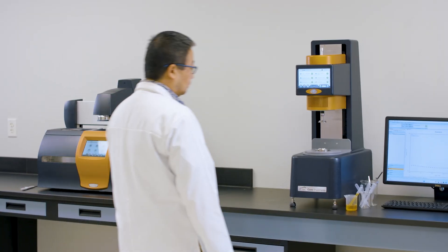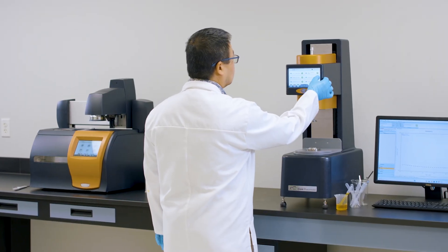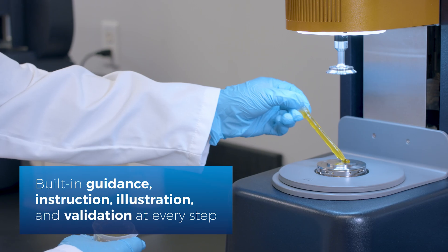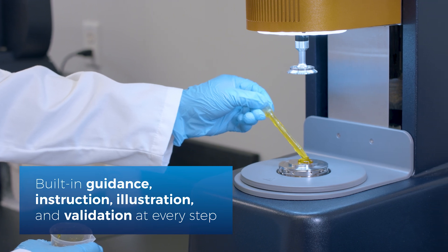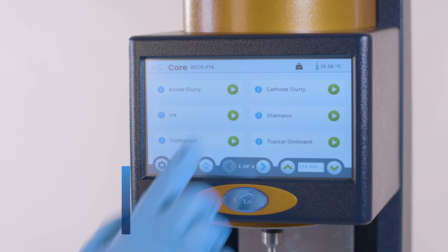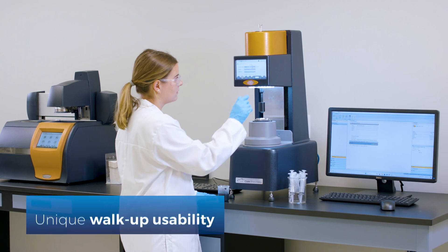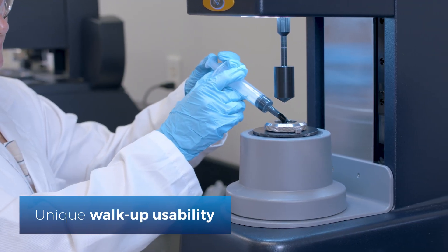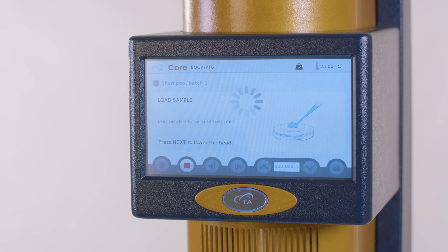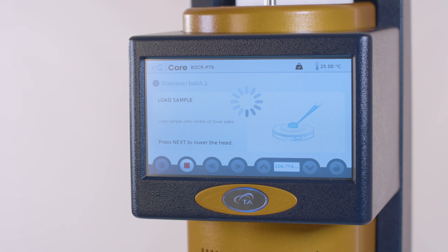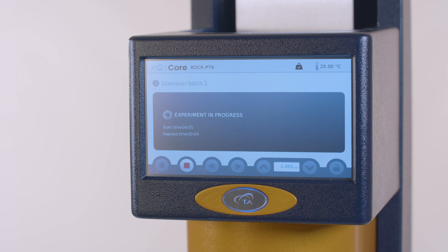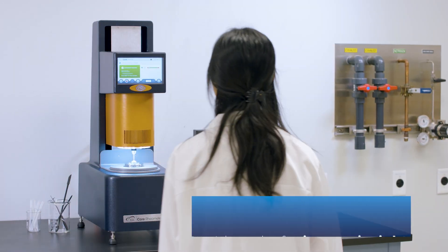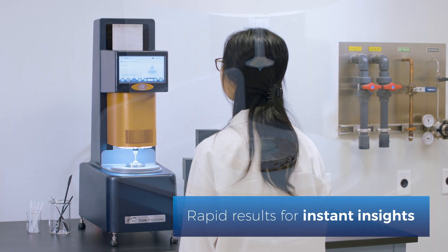New RioGuide software offers a streamlined user experience designed to facilitate user-friendly testing with built-in guidance, instruction, illustration, and validation at every step. Routine measurements are performed entirely at the touchscreen, ideal for fast-paced, high-throughput labs. On-screen prompts guide users throughout the workflow — from loading the sample, performing the measurement, and cleaning. Results are automatically calculated and displayed on the touchscreen for instant insights.